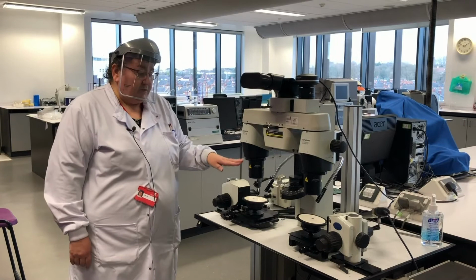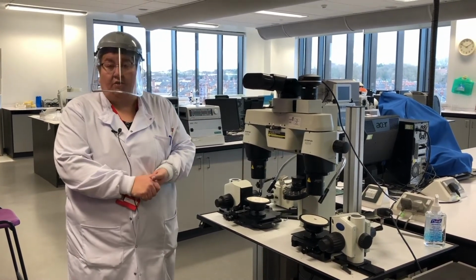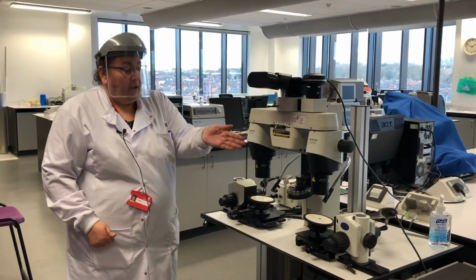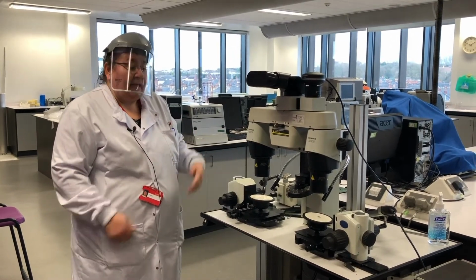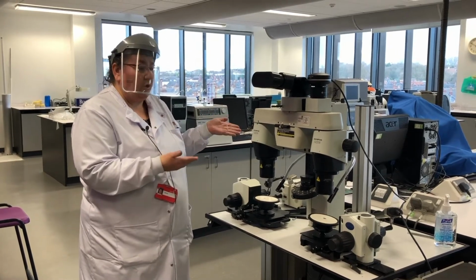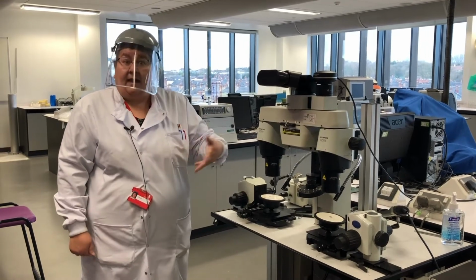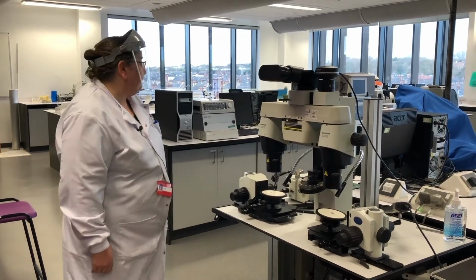We've also got our comparator microscopes that we use for our toolmark practicals. We can also use these for cartridge identification, so we can look at the striations on gun cartridges to compare them side by side, again with tool marks as well. So they would develop and work on a number of weapons to then see if they could identify a set weapon at a crime scene.